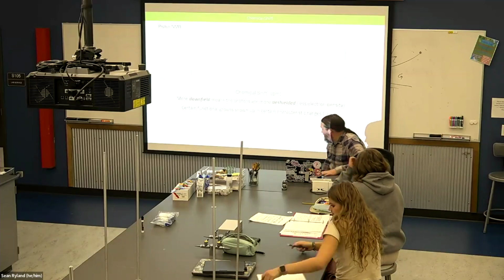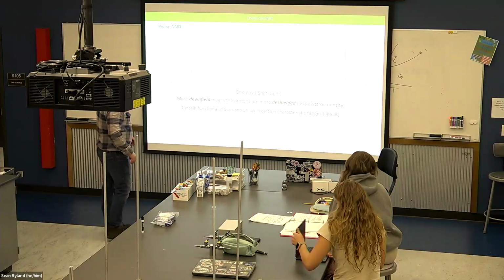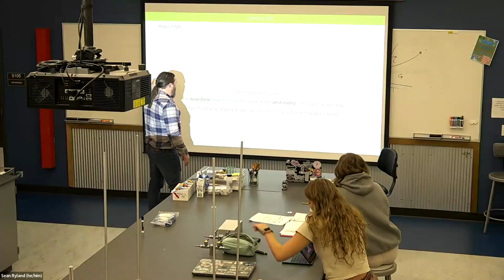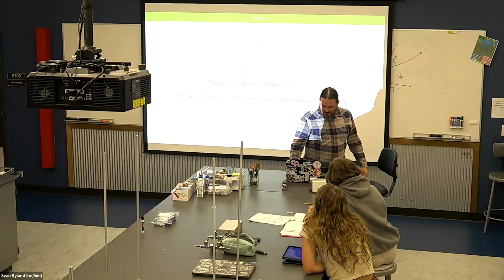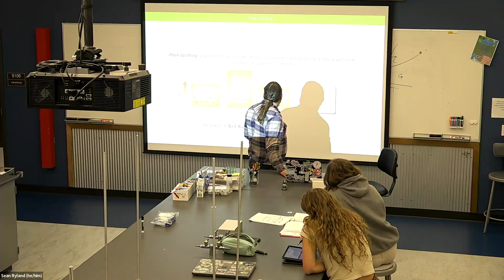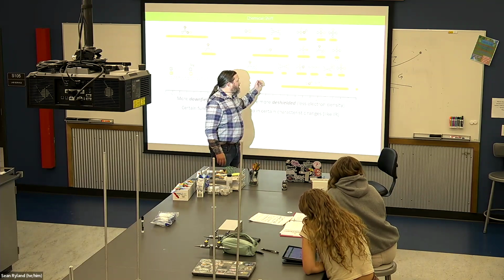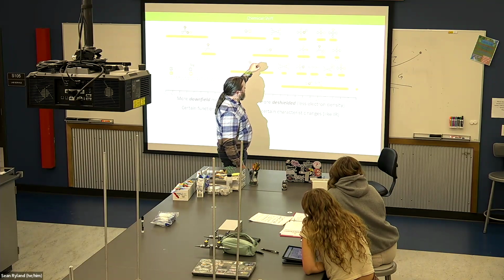All right, so here's where we left off. This is our model NMR spectrum. We started talking about more downfield, further to the left, meaning less electron density. Right? And we see that different functional groups show up in very specific areas. And you'll notice there's a lot of kind of splitting hairs.